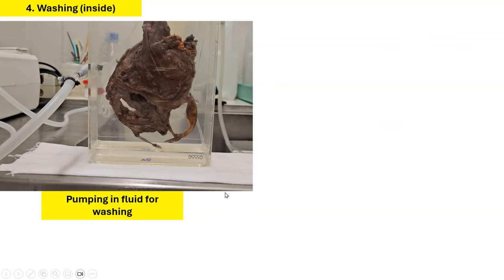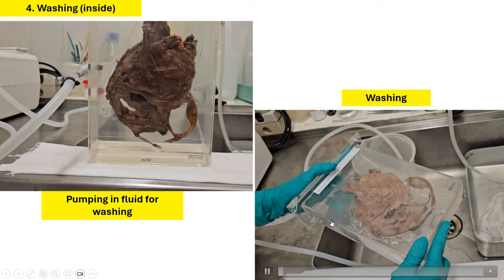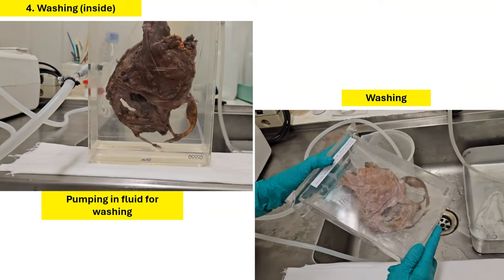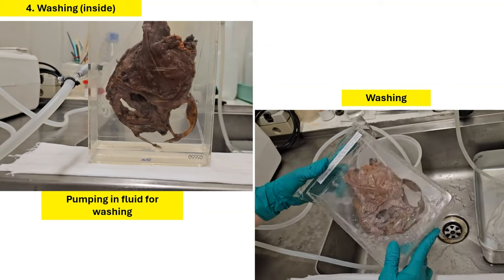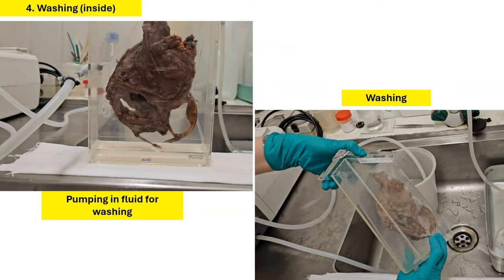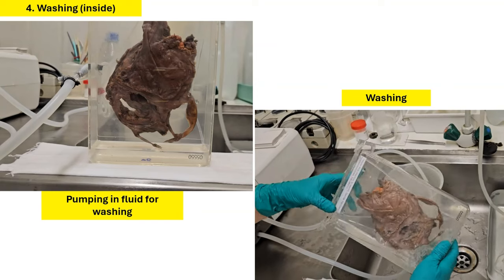The next step is then to pump clean fluid into the container, so that we can gently rinse the internal contents of the container. This may require several rounds. Sometimes the fluid gets a little bit cloudy, so this is washed until the fluid runs relatively clear. It may take several rounds of suctioning and pumping fluid in.